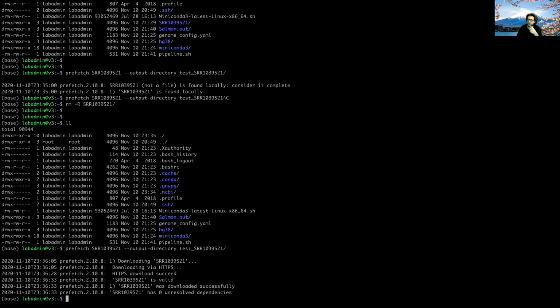If you've got Conda on your machine and you type conda install and then the name of what you want to install, it will install it. That's how I installed all of these packages, with conda install prefetch or conda install salmon. That's how I recommend everyone do things for the most part.